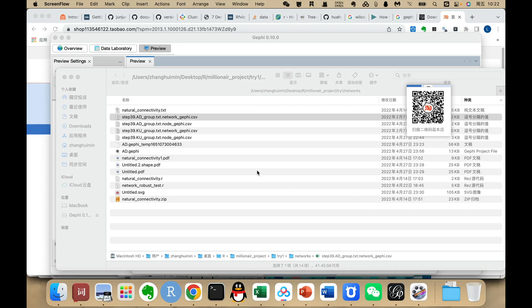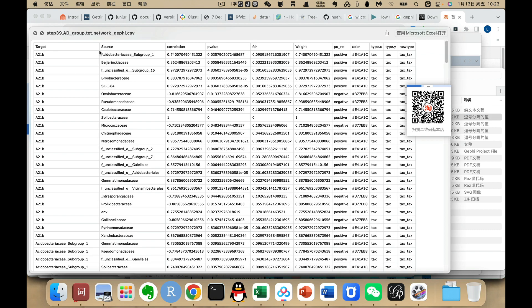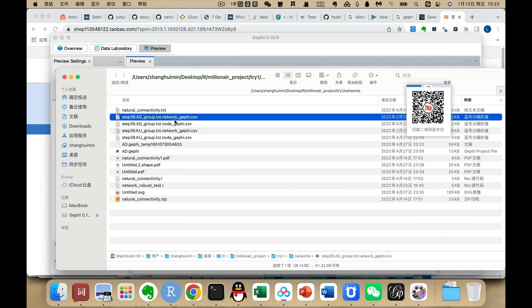Hello, this is Lucy again. After you run the script 39, you will get an input table like this — a network file for Gephi and a node file for Gephi. This is the correlation table we get after running the script. We have a source, a target, a correlation, a low weight that is the absolute value of correlation, a p-value, and color settings for positive and negative correlations.